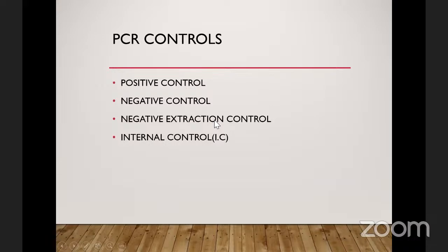So for a positive control, I have my reagents, right? And then I set up a PCR. I run the PCR reaction. And at the end of the day, I don't have a single positive sample. If there is no positive control in that particular run, how am I sure that my reagent is actually working? So positive control will help us to establish confidence that the reaction can actually amplify what it was designed to target.